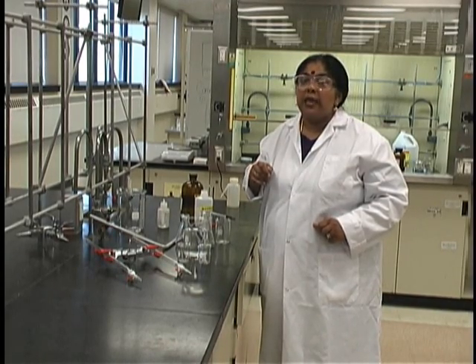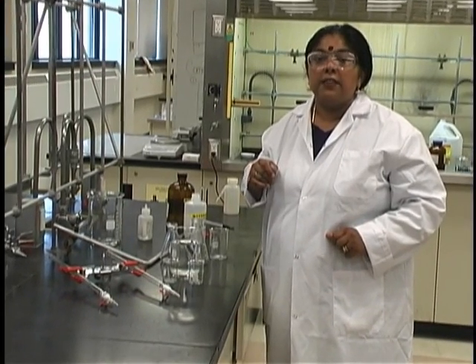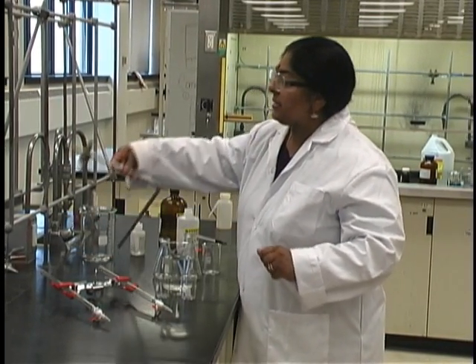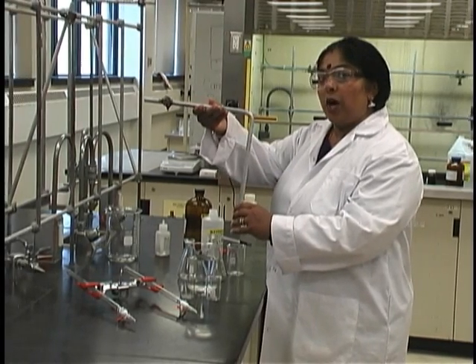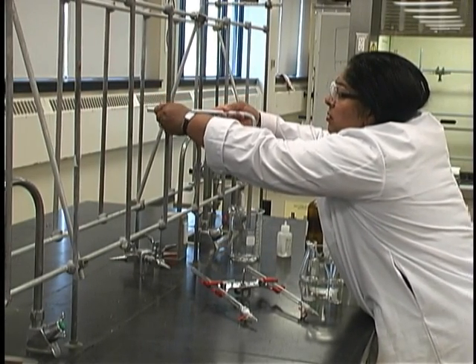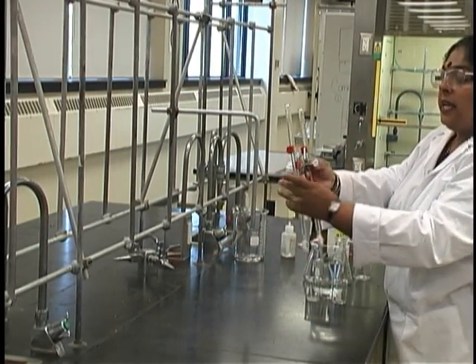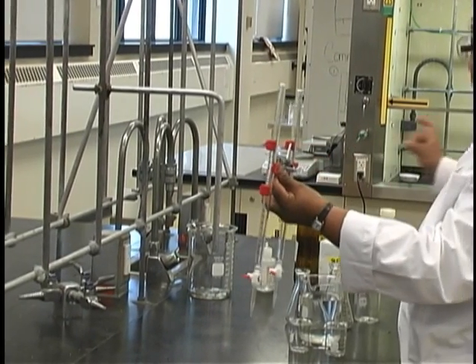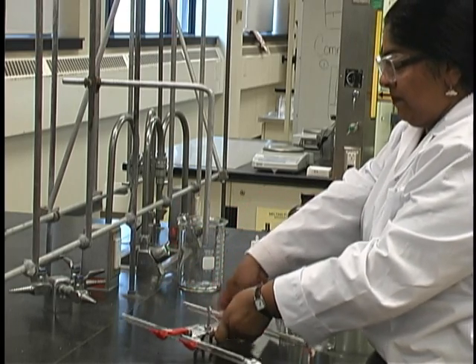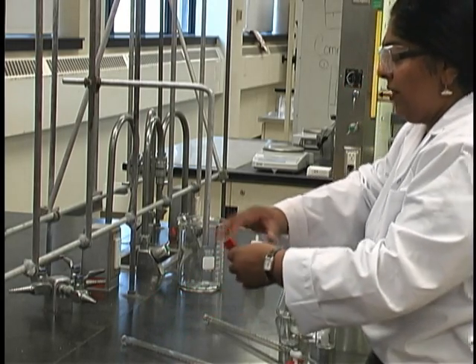For the purpose of this lab, we have a large number of labels that have been prepared for you, and it is strongly advised that you use these labels as and where you need them. To prepare your setup, obtain the extension L-bar and place a clamp on it, then attach it to the stand on your bench. Obtain a burette clamp located underneath the sink on either side of every section, and place the burette clamp on the extension L-bar.